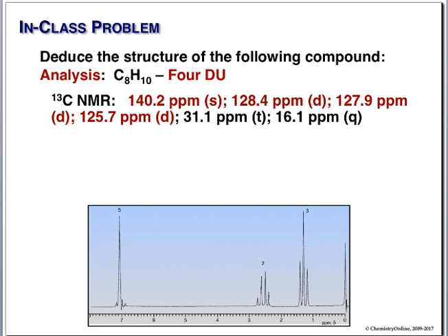If we look at our proton NMR, right away here at 7 parts per million, we see a peak, a little bit of noise down here, but a nice peak, area 5. What does that tell you? Monosubstituted benzene, right? And here we have a quartet and a triplet. What is that screaming at you? It's screaming ethyl group, isn't it?